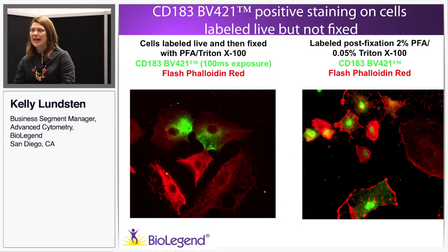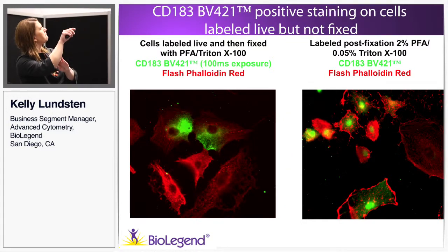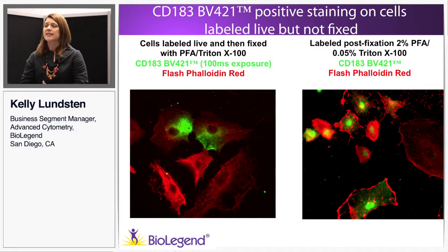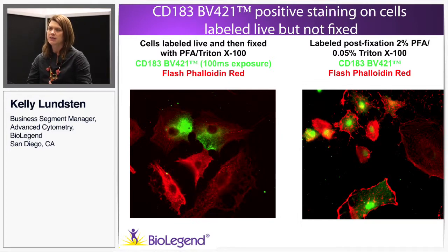However, when I did exactly the same thing with the CD183 BV421, we have a custom filter for our BV421. It's a fantastic fluor to use for phenotyping, a blue emitting fluorophore, but it does not always fit into everyone's DAPI filter. We have a custom filter. I can share with you what that is in the end. This was totally amazing.